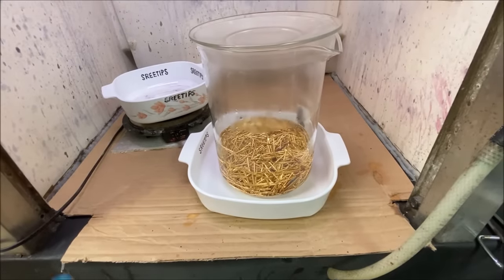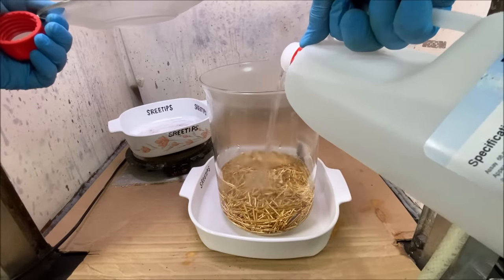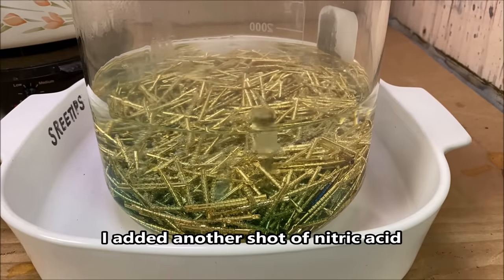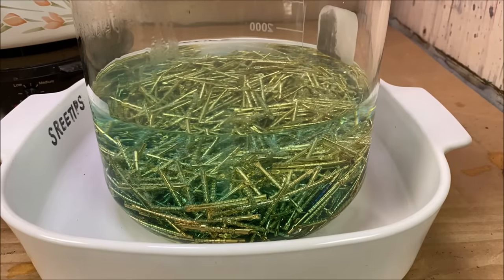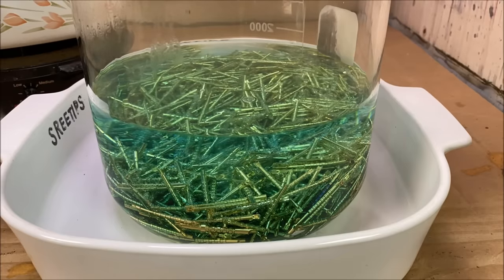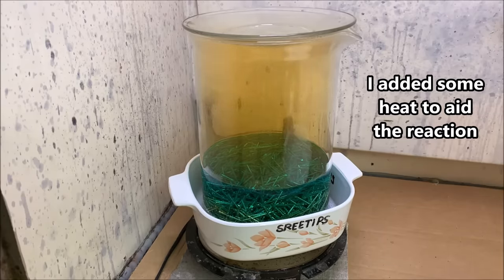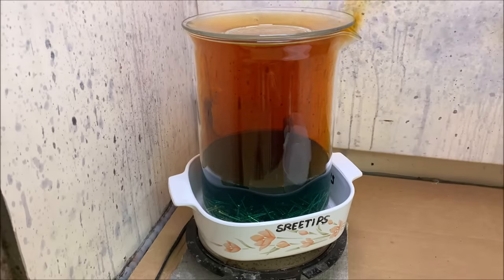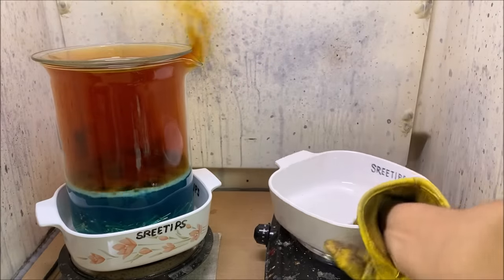Since it's cold and we're just starting, what I think I'll do here is add another dose of nitric to it just to get things going. I don't want to put too much in right off the bat because it could create a boil over situation. This first group is boiling nicely.